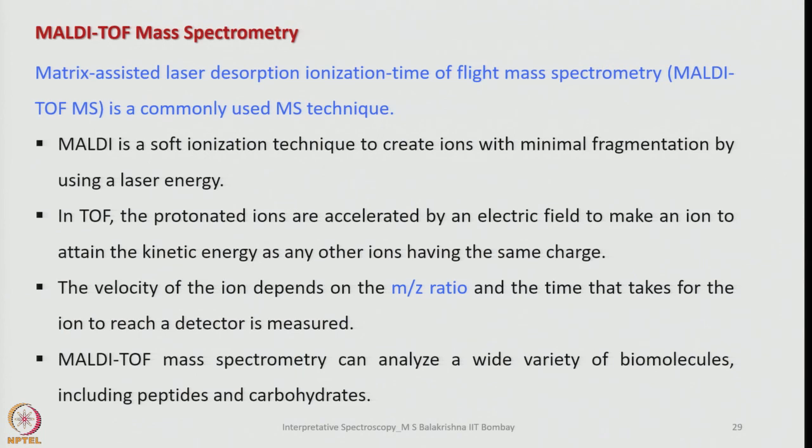So now let us look into some other spectrometers we use in mass spectrometry. One such instrument for high molecular weight measurement is MALDI-TOF mass spectrometry.